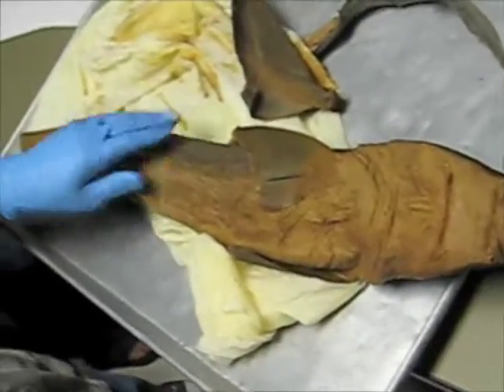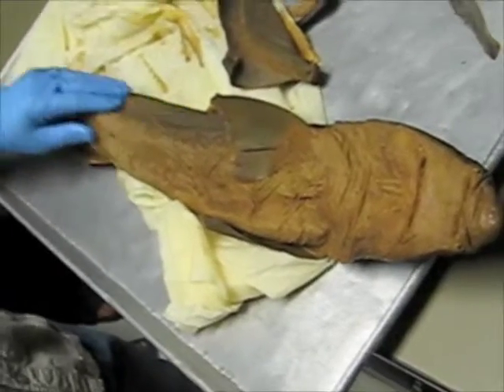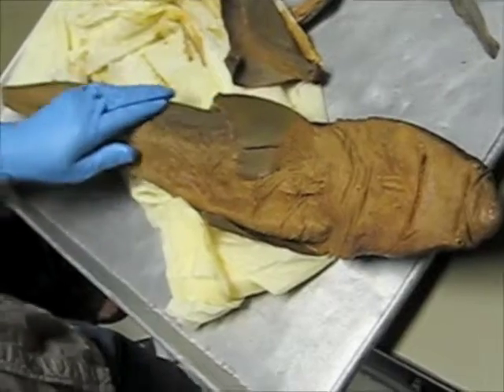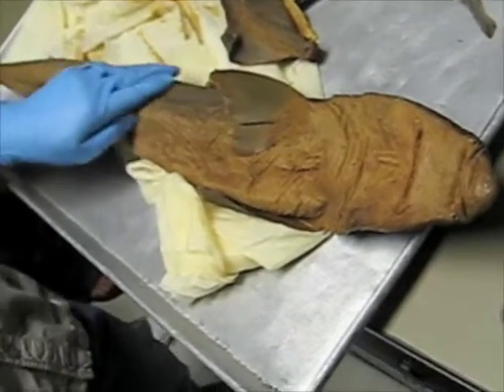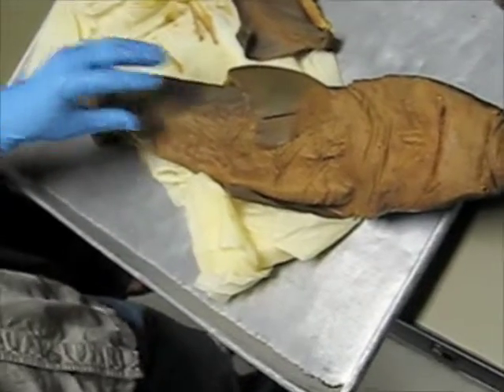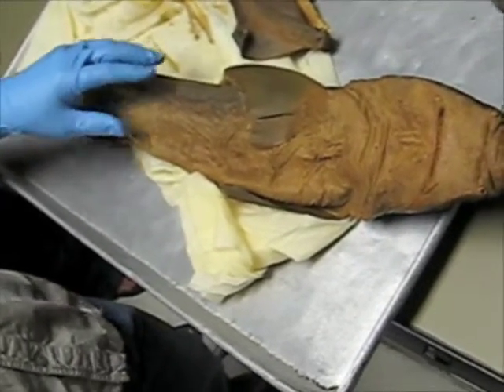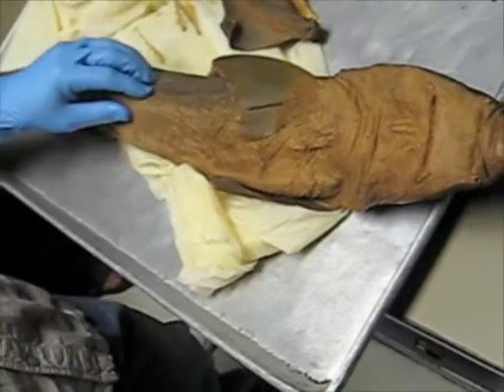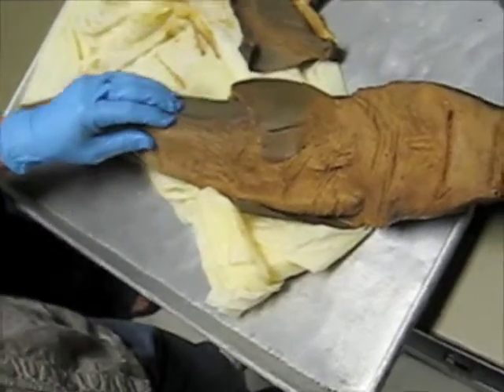If you rub it from anterior to posterior, it's nice and smooth, but if you go posterior to anterior, you feel that, you can kind of hear how it's kind of rough, all right? And the reason why it's like this, you're looking at the type of scales that they actually have. So, these guys have what's called placoid scales, right? They got little teeth on them, and we'll talk about those guys in lecture.